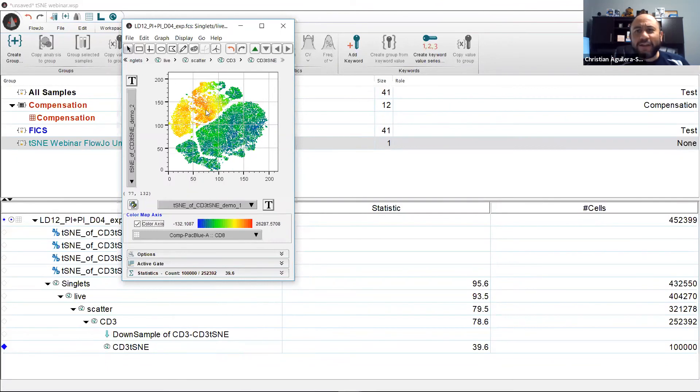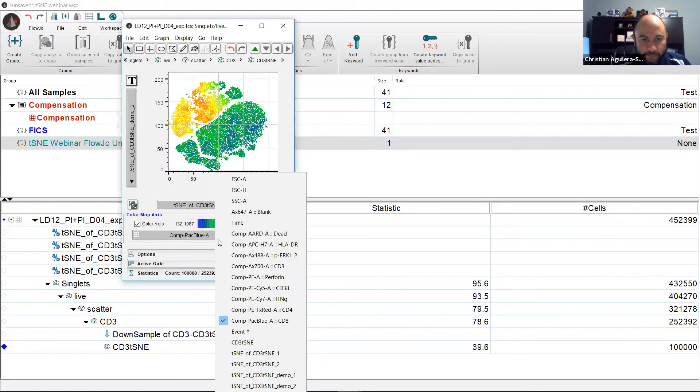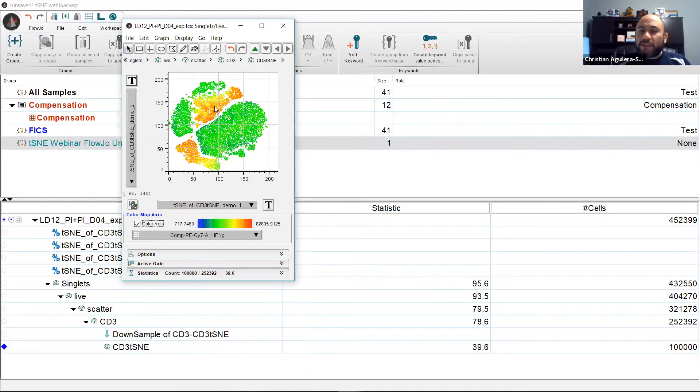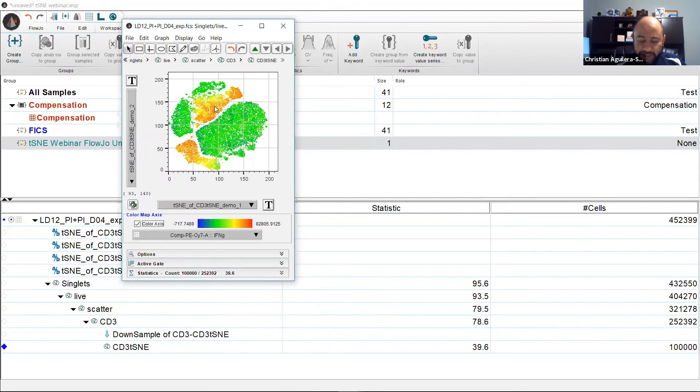Lastly, why don't we ask where are interferon gamma producing cells? We select interferon gamma and here we go. So this is a very quick way of interrogating your t-SNE space.